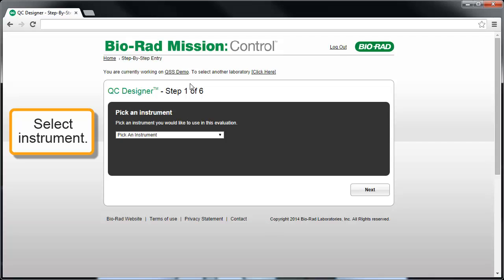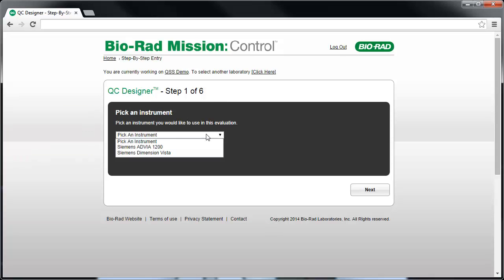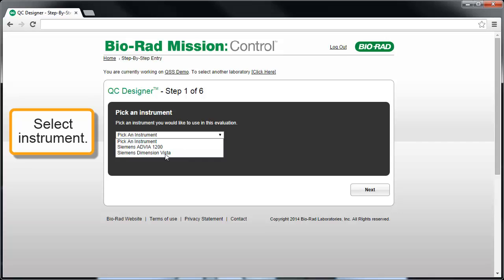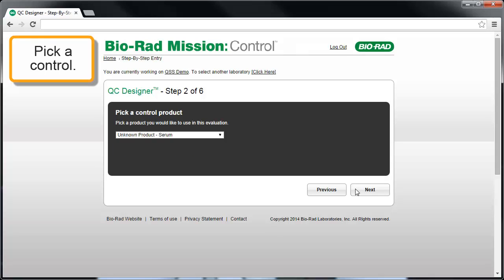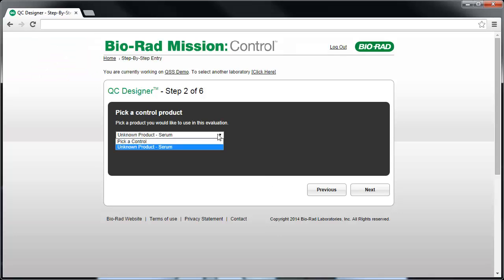In Step 1 of 6, pick the instrument you wish to set up, then click Next. In Step 2 of 6, pick the control product you wish to set up for the instrument selected in Step 1.